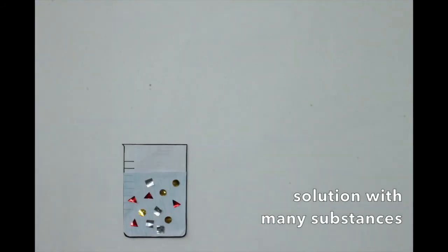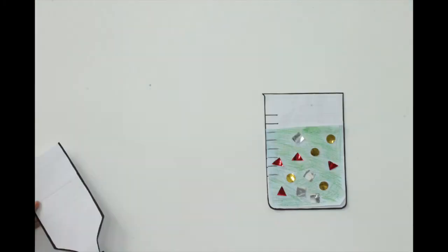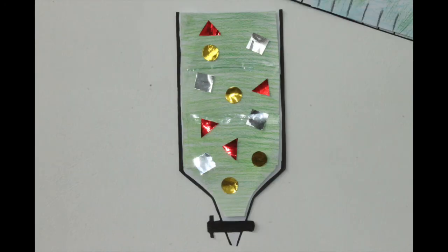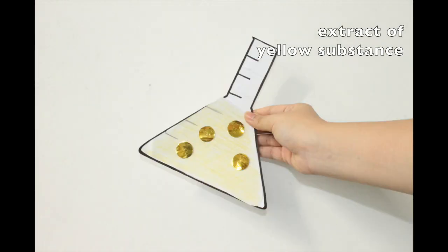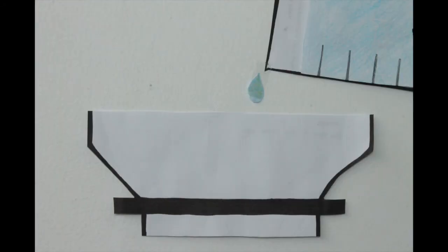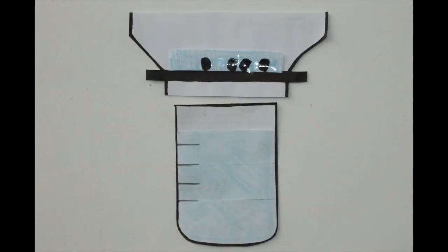Extraction is a way to separate a desired substance when it is mixed with other substances. A way to do that is by diluting the sample in a solvent that only attracts the desired substance but does not attract the other substances. Purification is to remove any impurities. We want to make sure that our sample is pure. Think of it like filtering dirt from water.